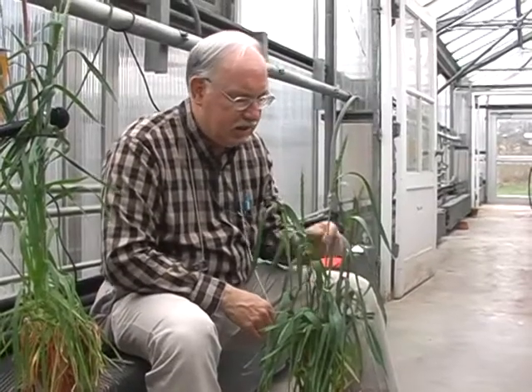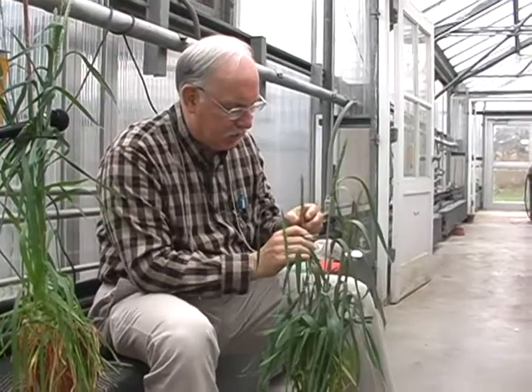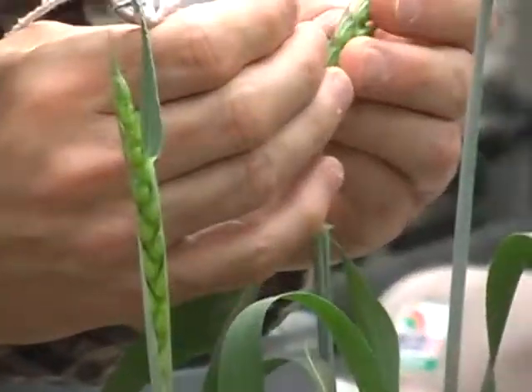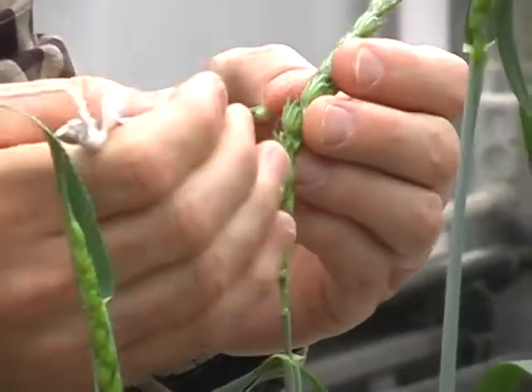What we're doing here is emasculating a head of wheat. This is what every cross starts with. The small flowers at the bottom, we pull off. Then we take the central flowers and pull those off.